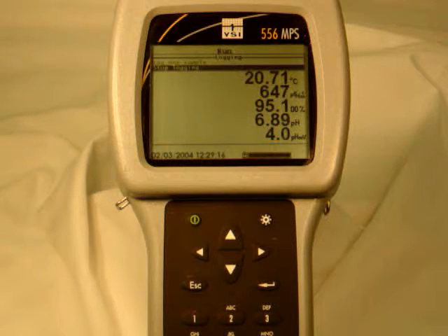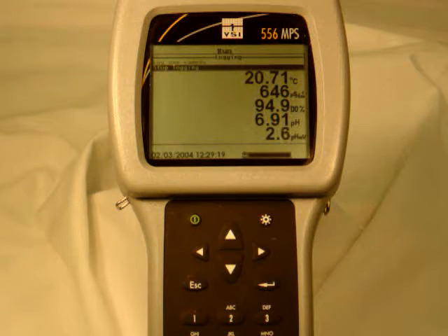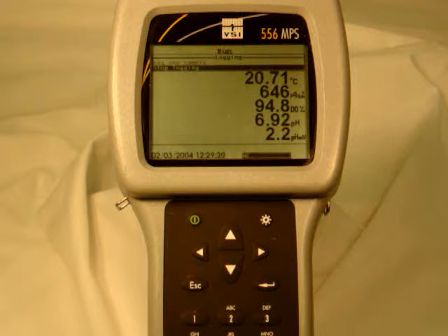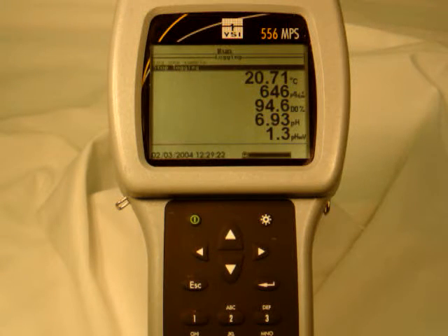Actually, it's not slowing down now. It's taking its time. It's getting to about seven points from the two, so it's going the right way.